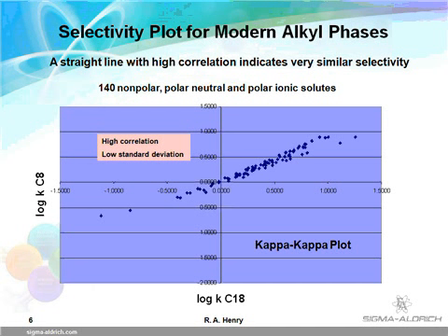Even if successful with one C18 over another for a difficult separation, lot evaluation should be conducted early in method development. Although C8 columns often show similar selectivity to C18 columns, shorter chains sometimes show different selectivity because they can solvate differently with the mobile phase and interact differently due to the size and shape of certain molecules. Also, C8 reagents are smaller than C18 reagents and have improved primary phase coverage requiring less end capping. C8 phases show excellent peak shape and very high phase stability.